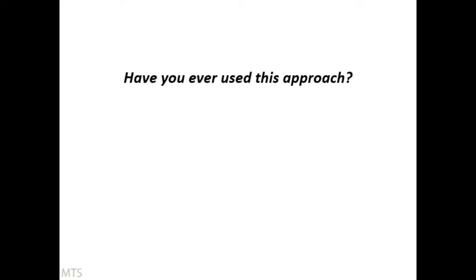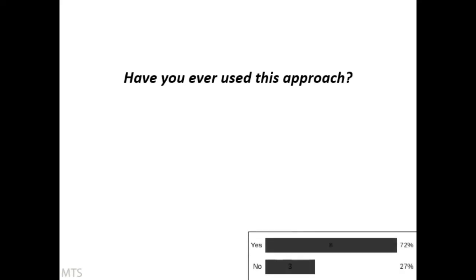But the other thing that you probably quite like to do is just learn more about how HPLC works. And I know when I started off my career, I was always doing this. What does this do? Try it, see what happens. So you might do it for that reason. So we've got predominantly yes, but a few no's. So something to consider, but a better strategy is good for good results.